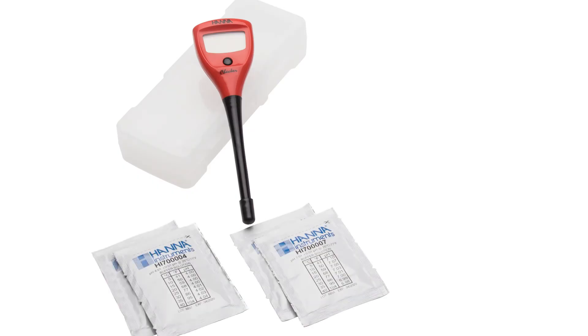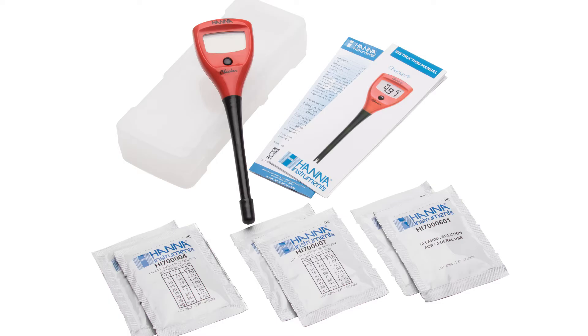The checker comes with everything you need to begin testing. Along with the checker comes buffer 4 and 7 packets, cleaning solution, the manual, and quality certificate. Before running out of these solution samples, I recommend you check out our compatible products on our website.